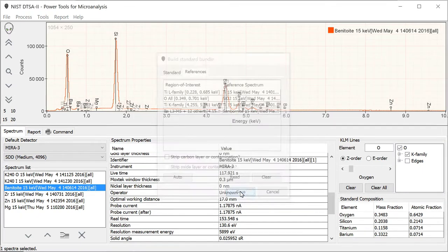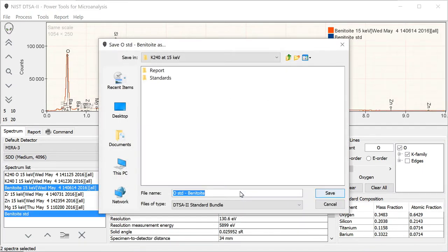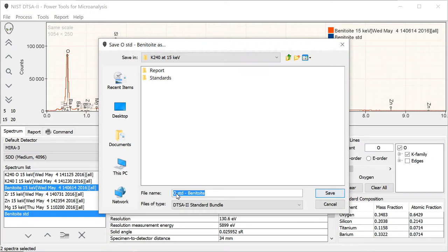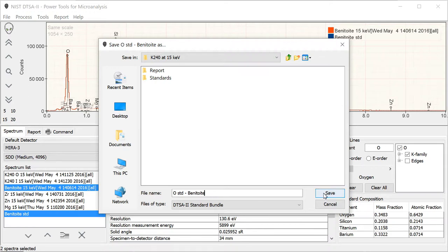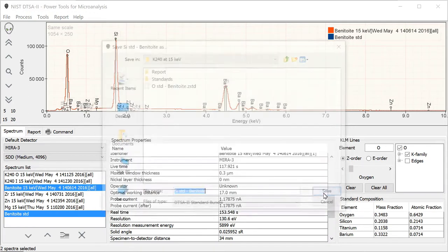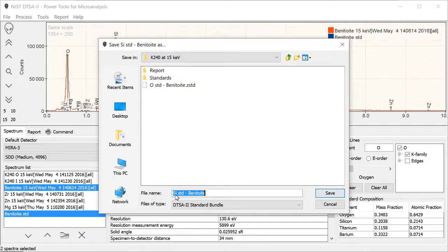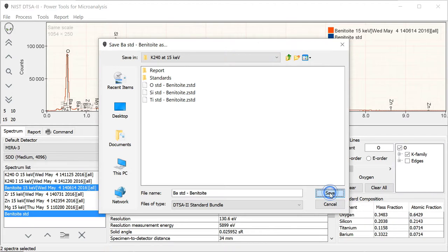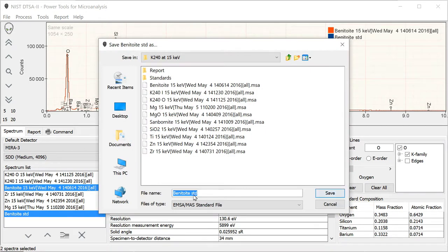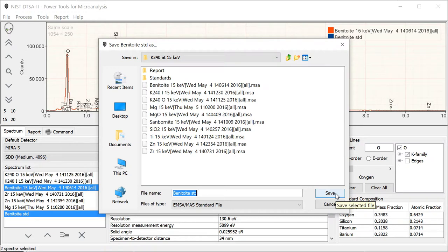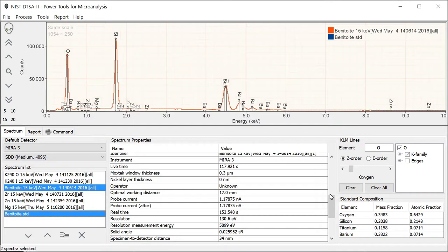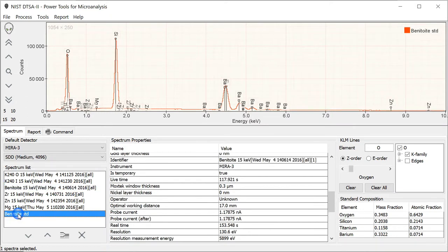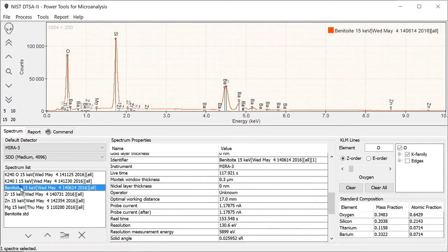Now we've specified references for all the interferences in this particular standard. Now we're going to save this away. When we save it, it gets saved to a file type that's a DTSA2 standard bundle as the type. Typically, the default name is like this, and I recommend that you keep this. It tells you what element it's a standard for. This is going to be the oxygen standard, and it's using benitoite. We save that away, and it's going to ask us a second time. Now it's for the silicon standard for benitoite. Third one is titanium standard, and fourth is barium. We've actually created four files now, one for each of the elements in this material. It's going to finally ask us if we want to save away the raw data as an EMSA file, and you can go ahead and do that too.